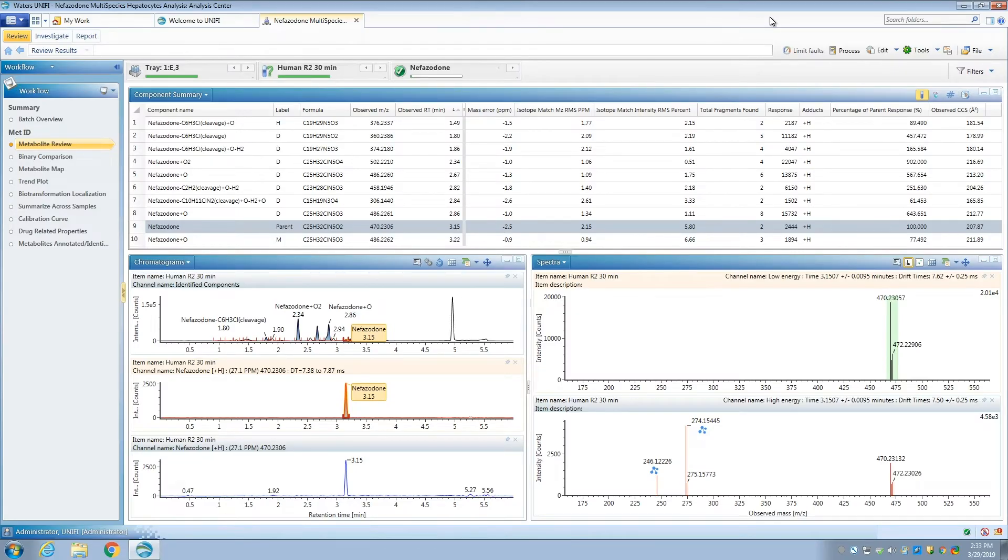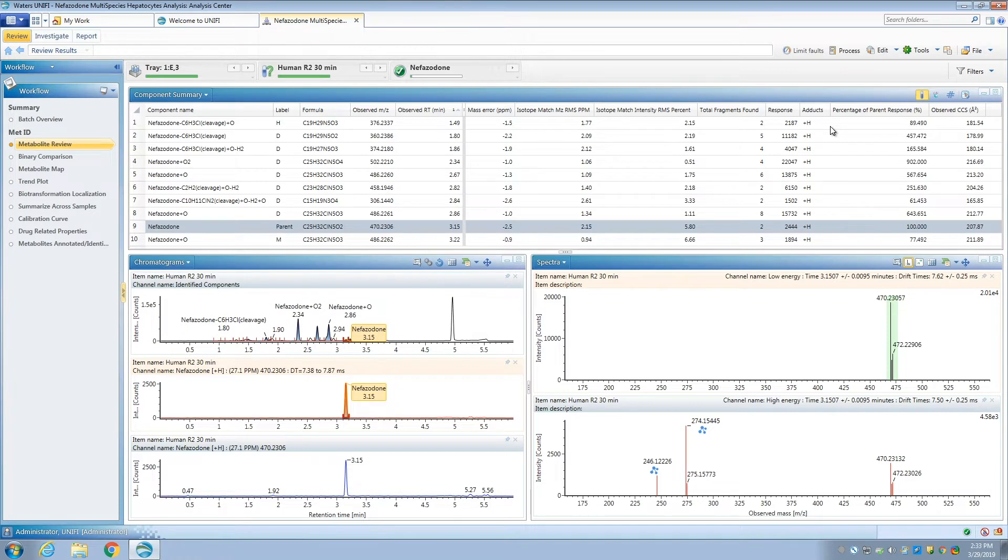In order to take advantage of all this extra information, Waters had to redesign its software to use ion mobility from the ground up. The result was UniFi. UniFi allows acquisition of high quality ion mobility enabled data, and most importantly, easy processing and visualization of the extra information.